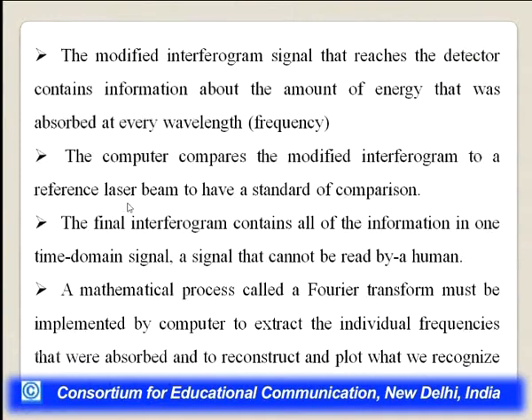The modified interferogram signal that reaches the detector contains information about the amount of energy that was absorbed at every wavelength, or we can say at every frequency. The computer compares the modified interferogram to a reference laser beam to have a standard of comparison.